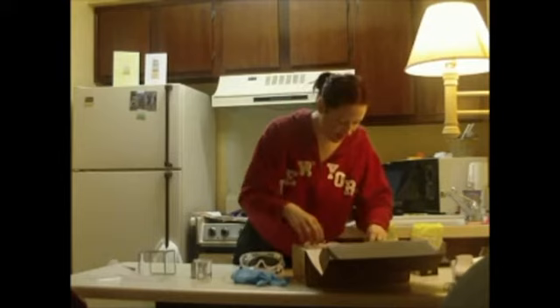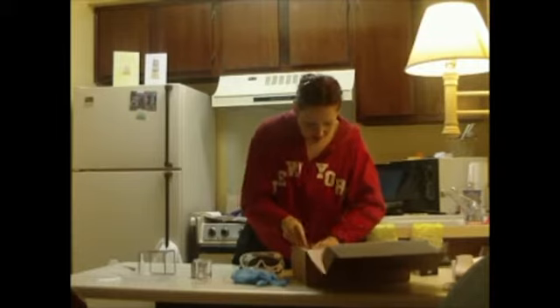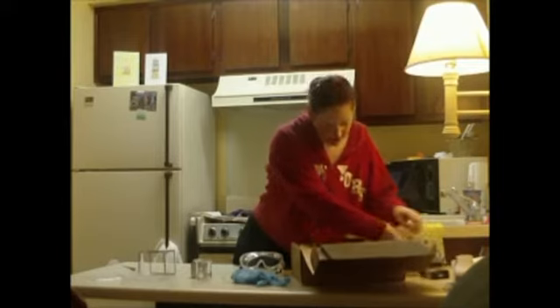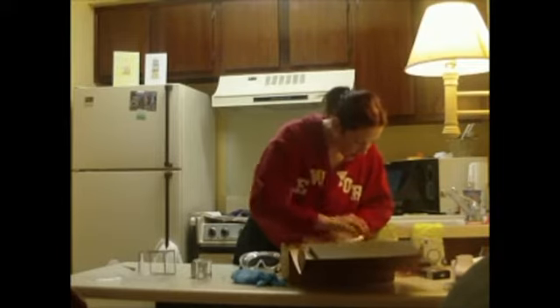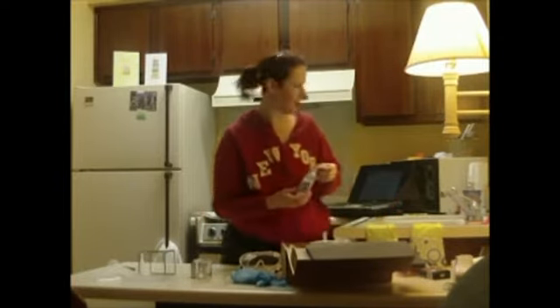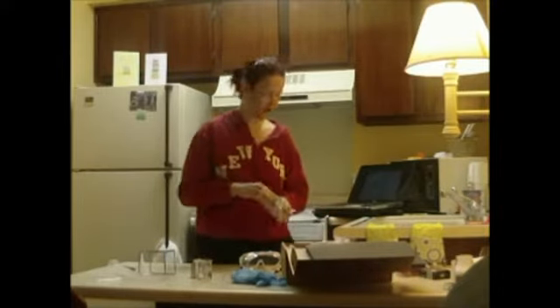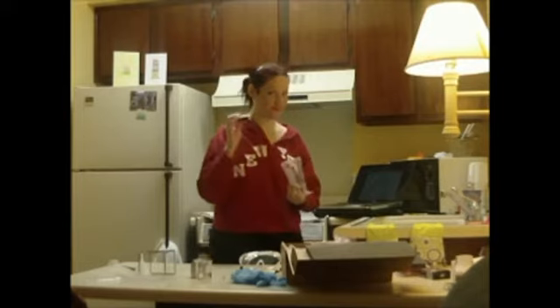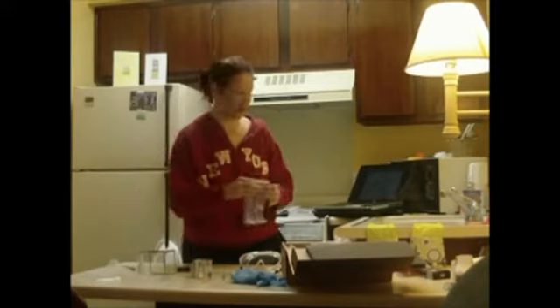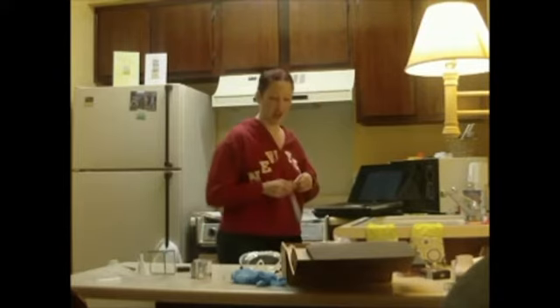I know I put the test tubes in a plastic bag so I'd be able to keep track of them in here. There's the bag. I'm going to need also out of this bag my matches. Our test tube, stick that in a well. Test tube clamp holder.